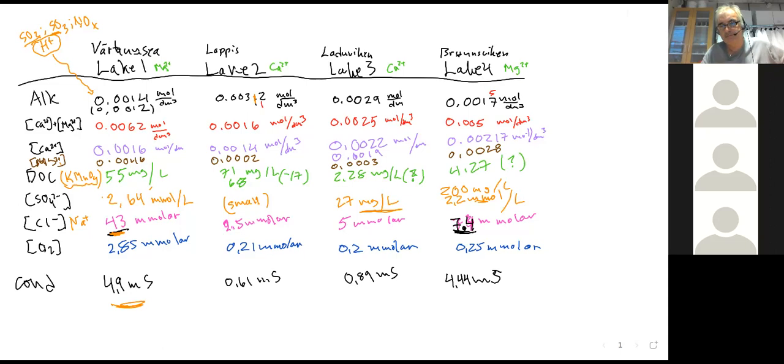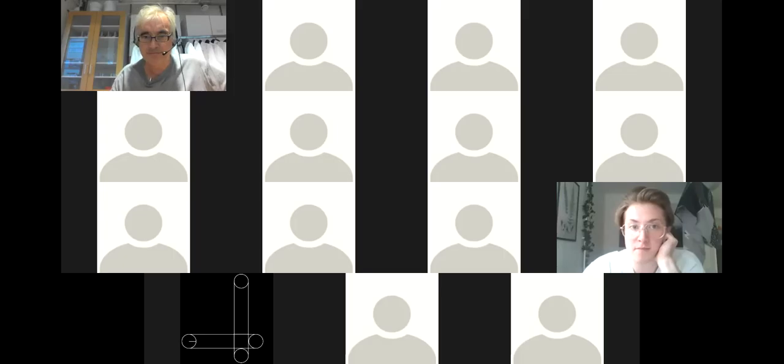Can I ask something really quick? Yes. Because I managed to get confused about the calibration curve for lab 2. The concentrations for the standard mixtures, was that from 10 microgram per liter up to 160? Okay, yes. Okay, thank you.